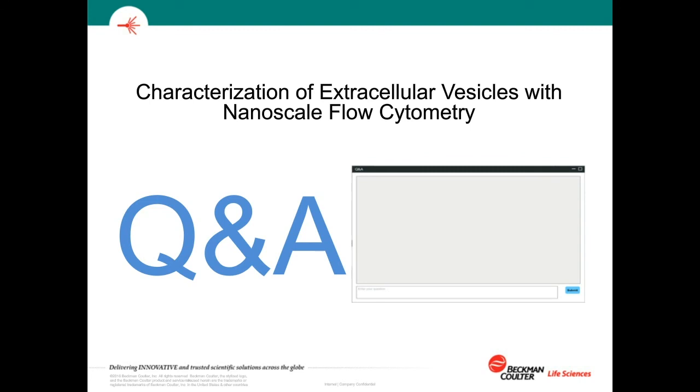Okay, George, the second question is, what is the source of PBS that you use for small particles? Well, I've used a variety of sources. The one that I use most commonly is from Sigma Aldrich. Sigma is owned by EMD Millipore. They're the water purification experts, and they tend to have pretty clean buffers. But you can make your own, even with 10x solution or even homemade PBS, as long as you use clean water, it'll minimize particulate.